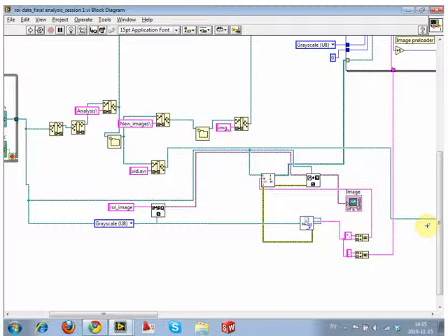But this is because in your folder everything is JPEG, so you just put this extension. Yes. If it was mixed, you cannot make a pattern. If it was JPEGs or text or whatever, then that works, because it's applying the JPEG filter to that set. The thing it doesn't work for is if you want to filter for a file name. So if you want to choose this channel CH00, it won't do that. But if you've got a folder filled with JPEGs and GIFs and bitmaps and text files, it will only pick the ones which have the same file extension as what you chose.